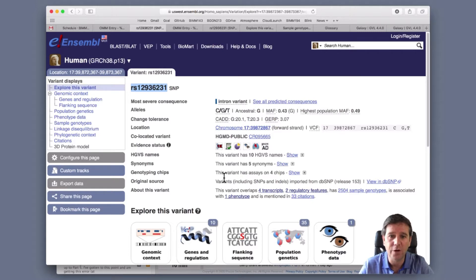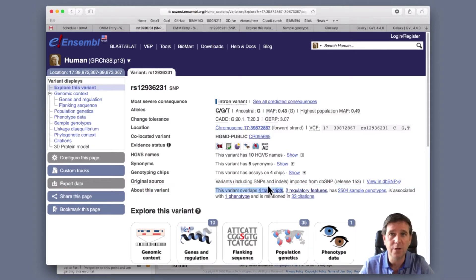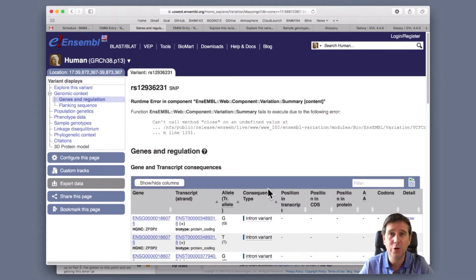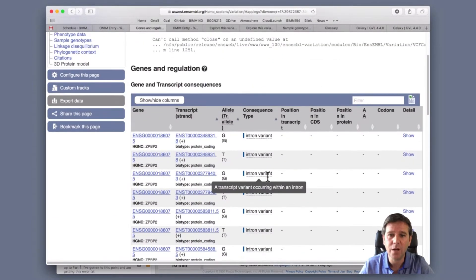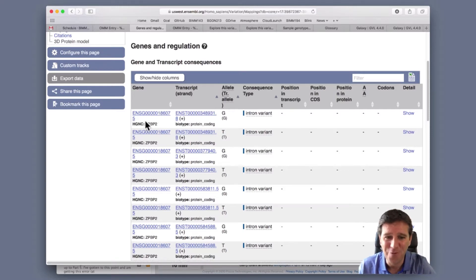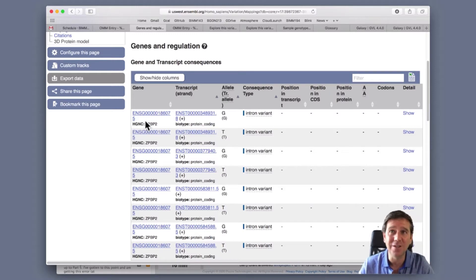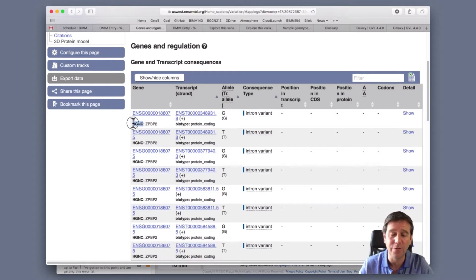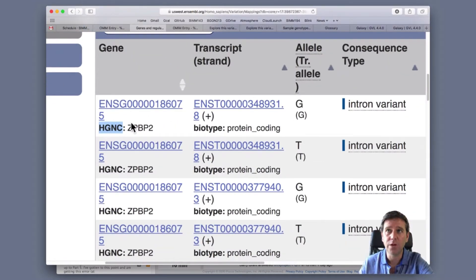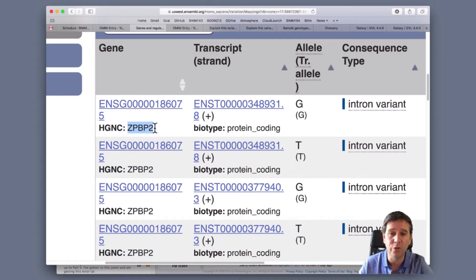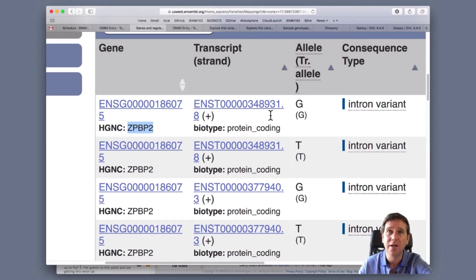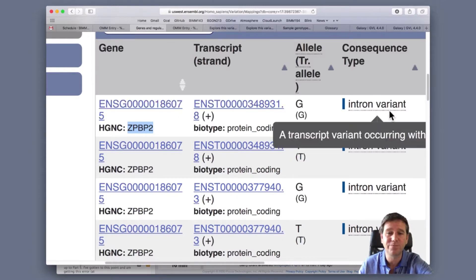It says this variant overlaps four transcripts. I'm going to click on this to see what the transcripts are. It opens a little table below with the Ensembl gene ID. That's not very helpful since I don't know the code, but it's got the Human Genome Nomenclature Commission name for the gene. Let me zoom in - it's ZPBP2. That's the gene name and I could look that up in NCBI Gene. This allele is G, with T's in other regions. These are different variants of this gene. In this case, it's an intron variant - that's what I want.